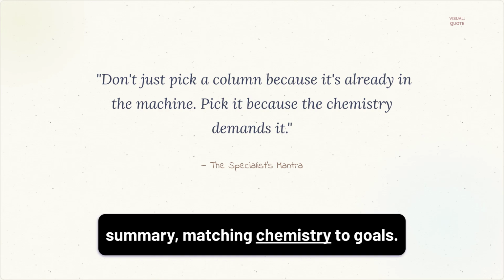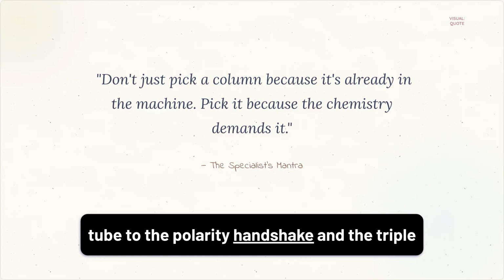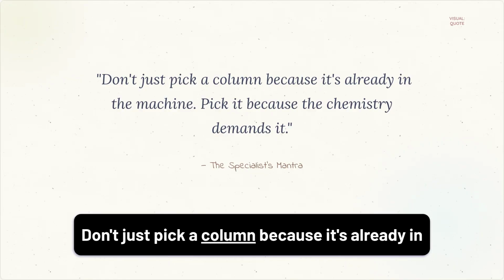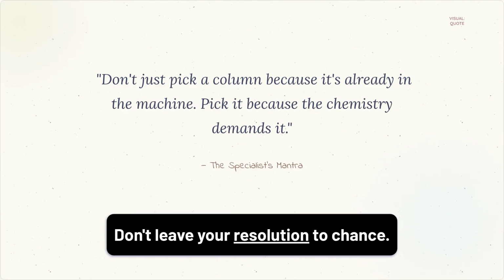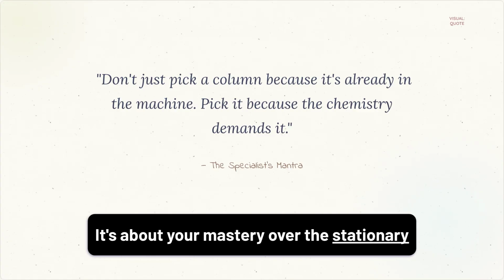Summary: matching chemistry to goals. Today we've moved from the architecture of the tube to the polarity handshake and the triple constraint of dimensions. Remember this mantra: don't just pick a column because it's already in the machine. Pick it because the chemistry demands it. You are the architect of this race. Don't leave your resolution to chance. Precision isn't about the machine. It's about your mastery over the stationary phase.